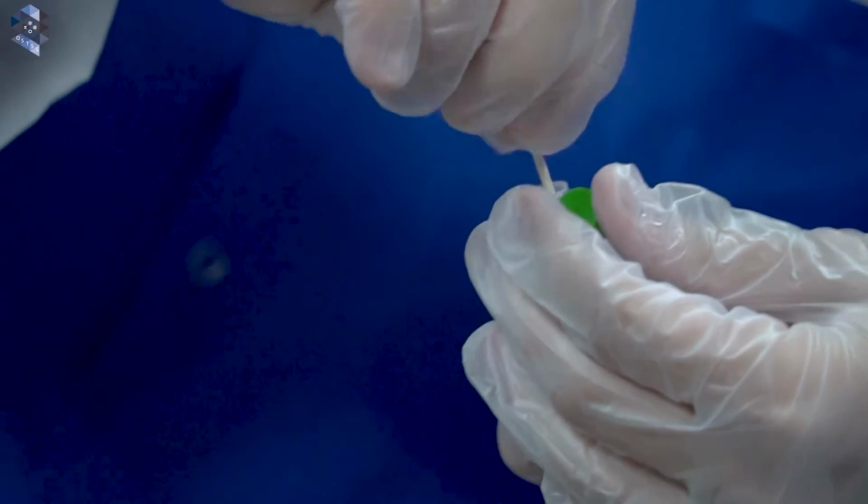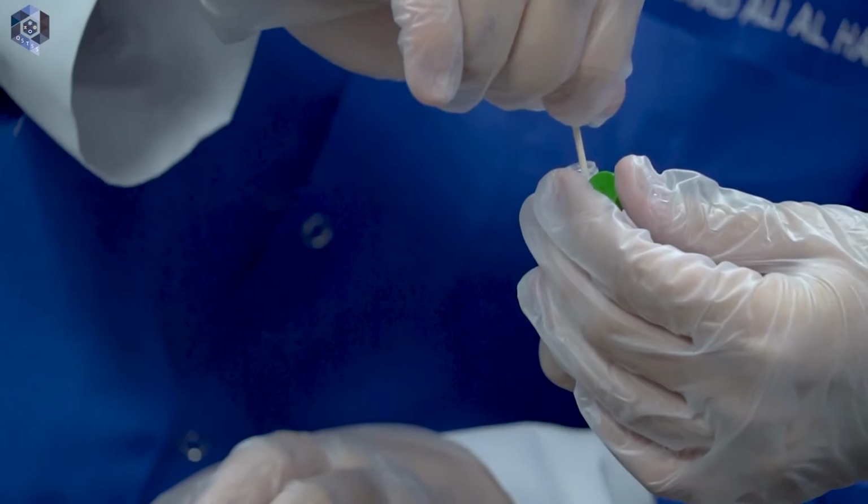Yes, swirl until you notice a change in the color.